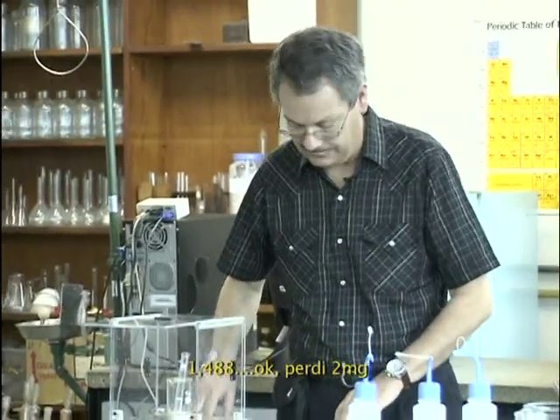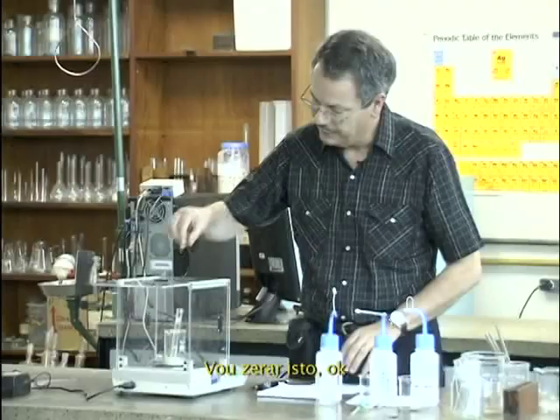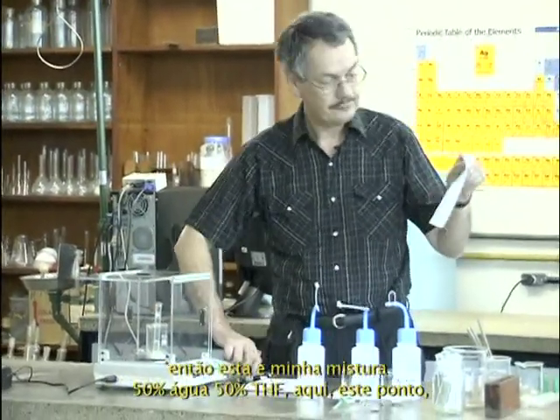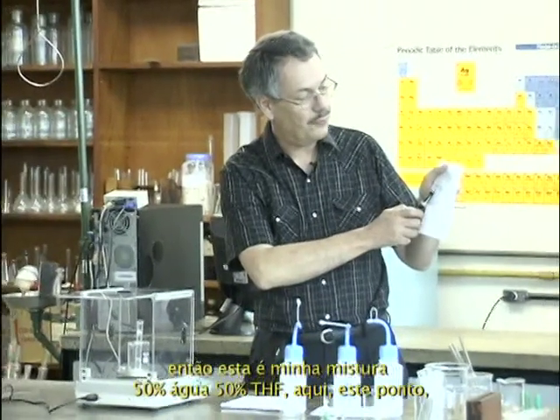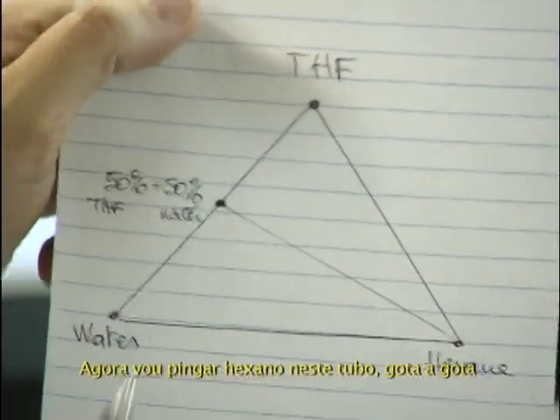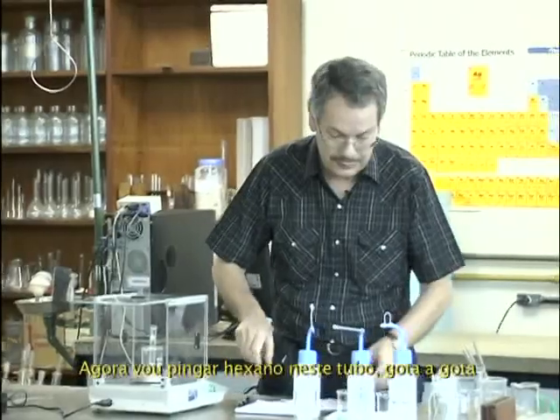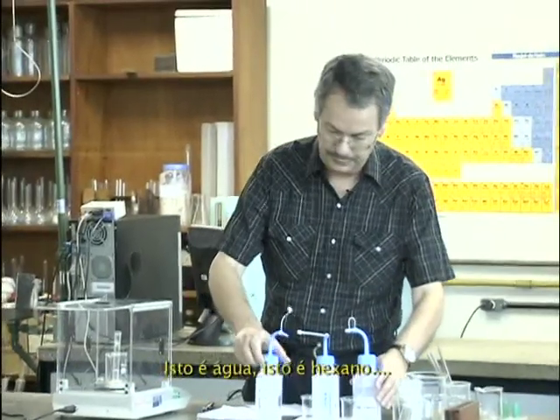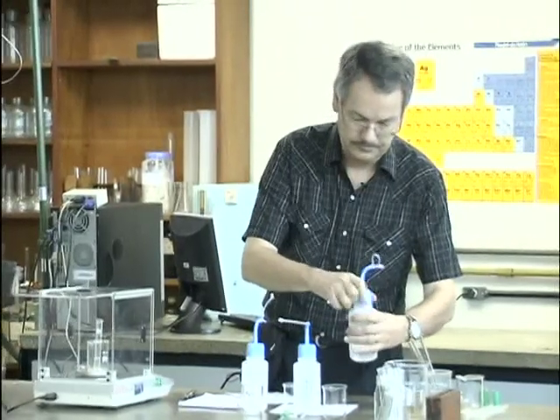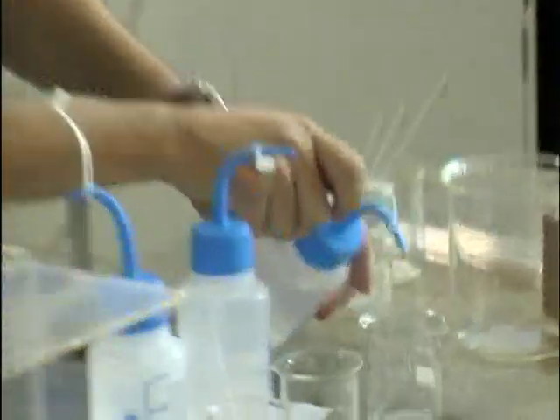1.488. Okay, I lost 2 milligrams more. I'll put 0 on this. Okay, so that's my mixture. 50% water, 50% THF, here, this point. Now I will drop hexane in this test tube, drop by drop. This is water, this is hexane. Oh, I can use, stupid.